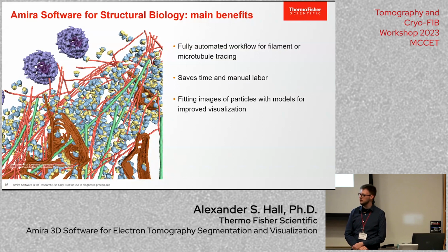I think deep learning models, though, train on features that may feel very obscure to human eyes. What I mean by that is the contrast and the intensity range from microscope to microscope, or even imaging session to imaging session, may be different enough that the model doesn't behave super well on your data.